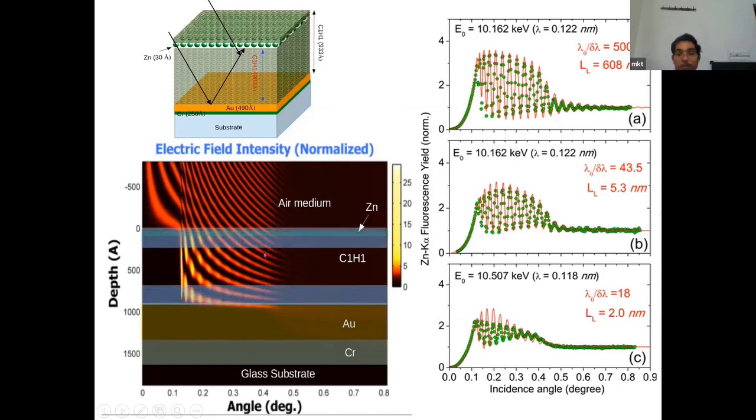So you put that absorption because multiple reflection is taking place. The beam is coming, reflecting here, and also absorption is taking place. That means the height is good because the beam is traveling from here to here, taking an extra path. Similarly, the beam which is reflected from here just comes back to the bottom side, so the beam again interferes here. So on both sides, the top and bottom side, you have less intensity. That's why you see the intensity is decreasing.